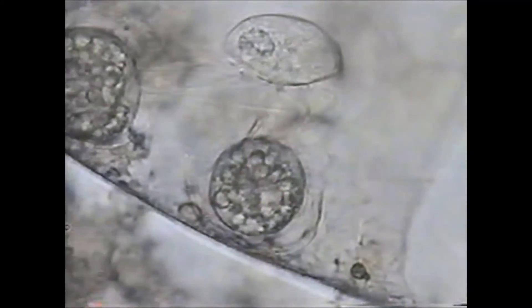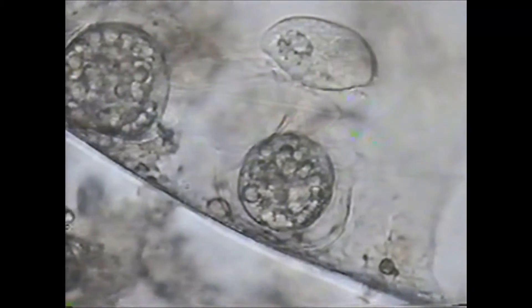They are classified as ciliates because they produce ciliated larvae which enable them to move. The larvae are produced by internal or external budding. The larvae, called swarmers, change into adults by metamorphosis.